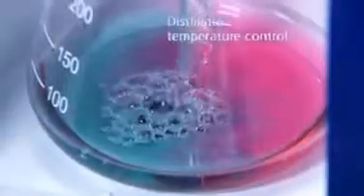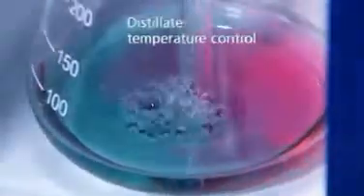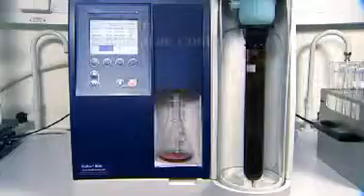The distillate temperature is measured before entering the receiver to make sure you get correct and reliable results. The self-adjusting cooling water system measuring the steam and distillate temperature minimizes water consumption.